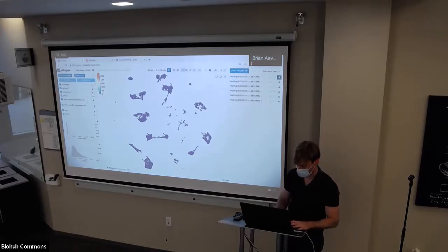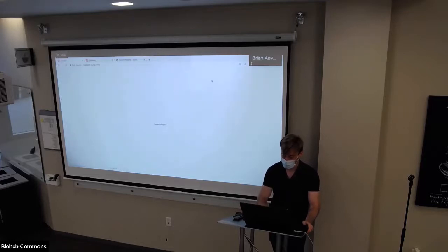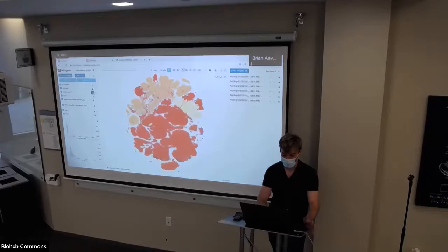So I think this is really exciting. And thank you so much to the initial people who worked on cell by gene. CZI, like I said, they created an interface that is the fastest I've seen. Like, this is ridiculous. We're loading a 500,000 cell data set, and then you can just do filtering on this and display cluster annotations with minimal lag. Although, as I say that, it kind of lags. But yeah, it's just beautiful.